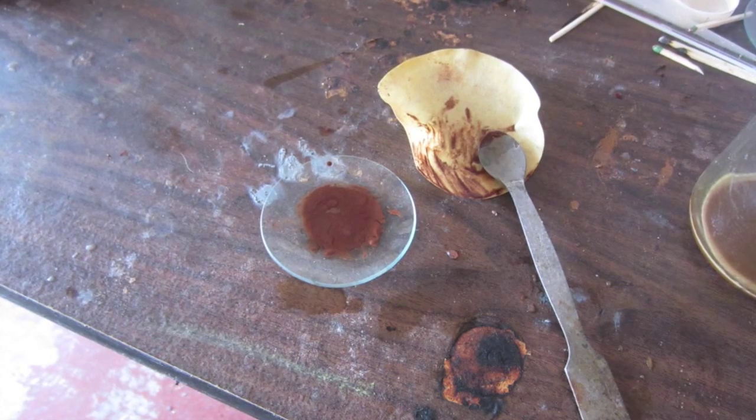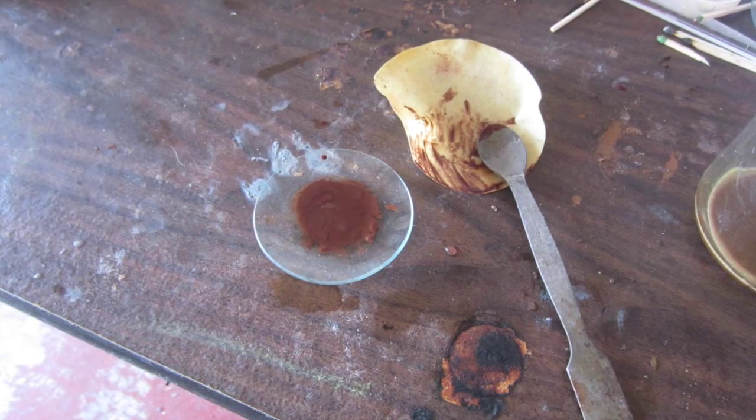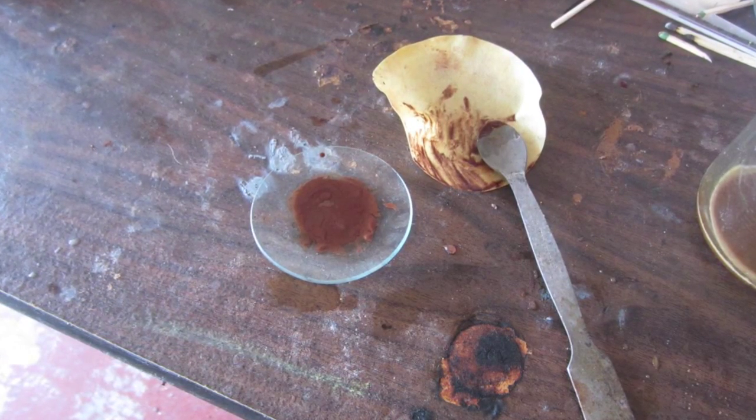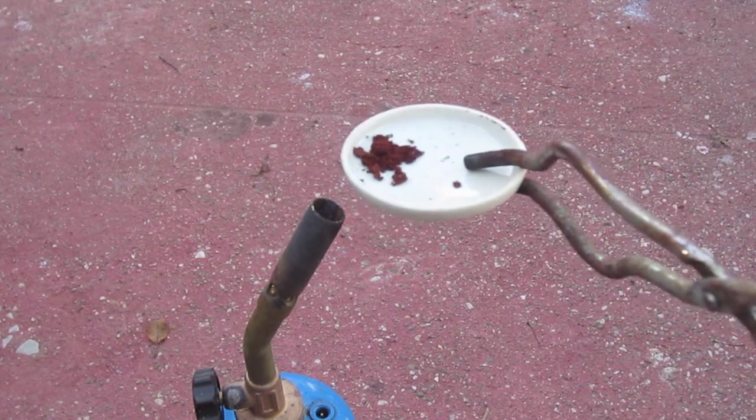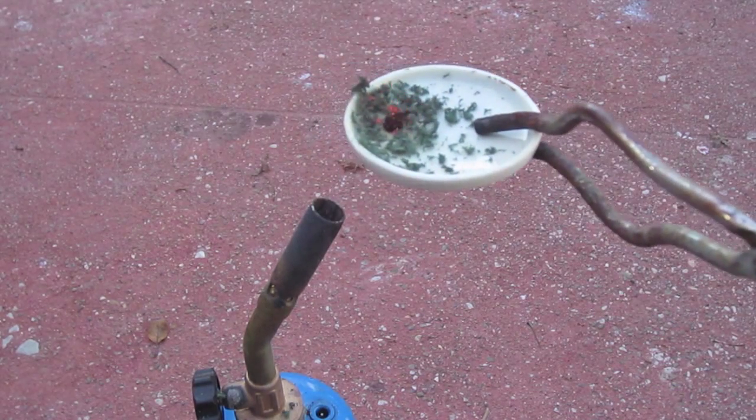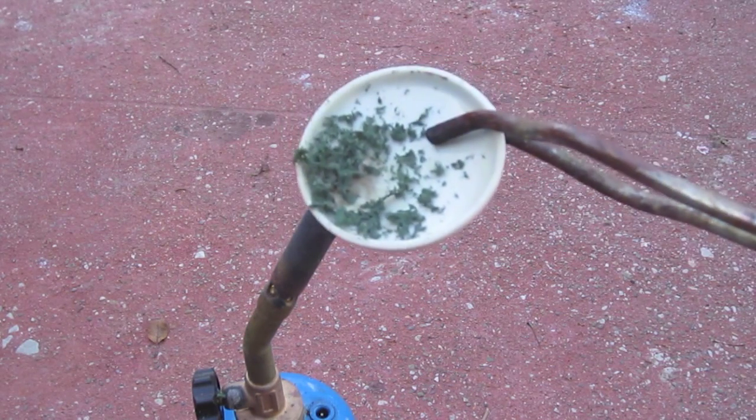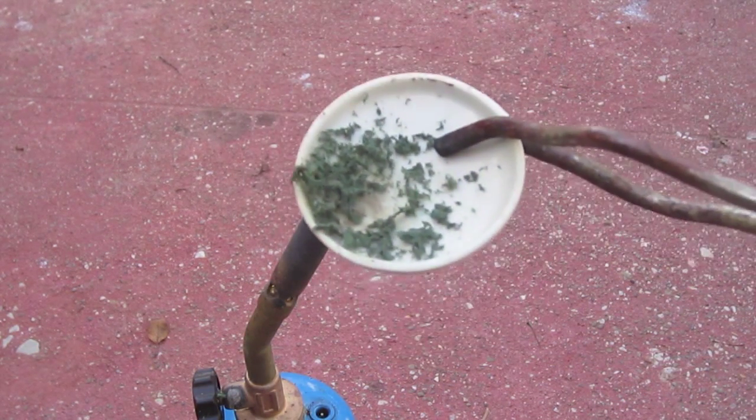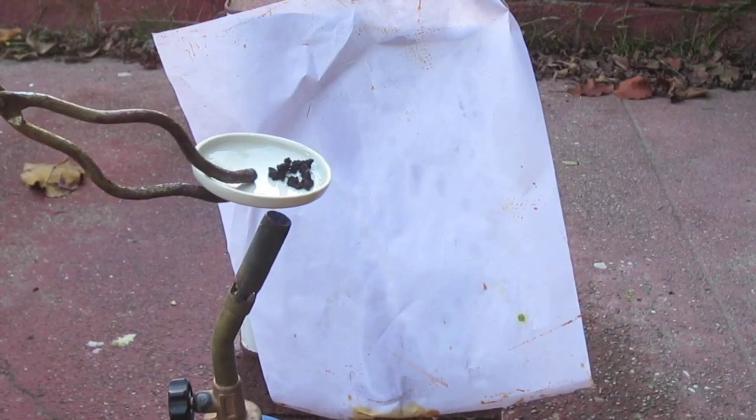What you see there is chromium-4 triamine diperoxide, a very unstable compound featuring chromium in the rare oxidation state of plus-4. And notice that the resulting compound is a very nice green, which is dichromium trioxide, chromium-3 oxide. So this is very interesting.